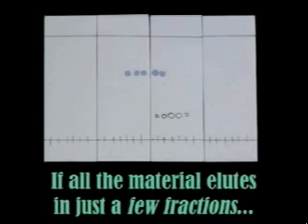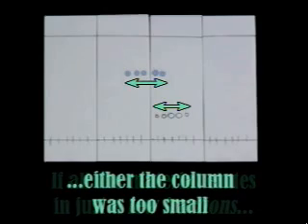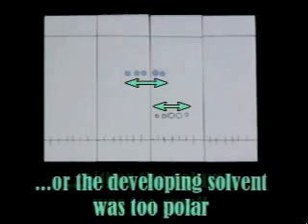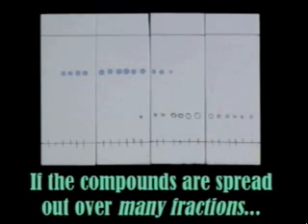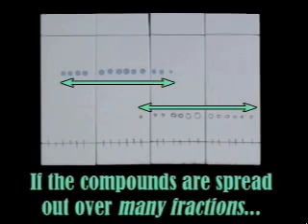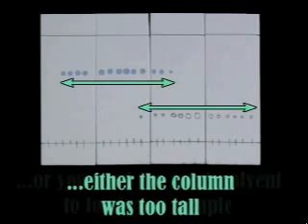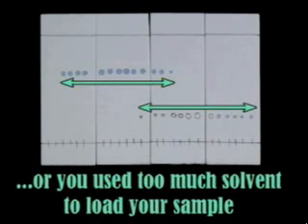If all of the material elutes in just a few fractions, then the column may have been too small, or the developing solvent too polar. On the other hand, if the compounds are spread out over many fractions, then the column may have been too tall, or you used too much solvent to load your sample.